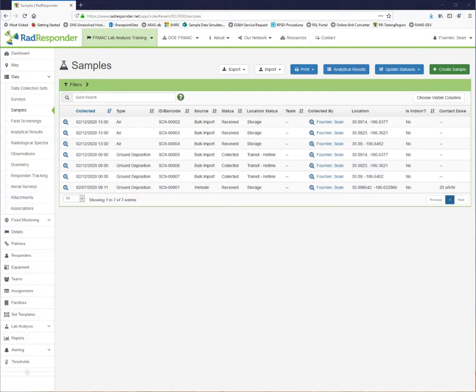Next, we must record the results of the sample screening or contamination measurements of the samples. A radiological control technician, or RCT, will perform a swipe of the sample package and count it. They will relay the information to you if it is contaminated or not and what the reading is. Furthermore, a contact dose rate should be taken at the hotline and recorded for the sample. Finally, the sample control form should be printed for each sample.